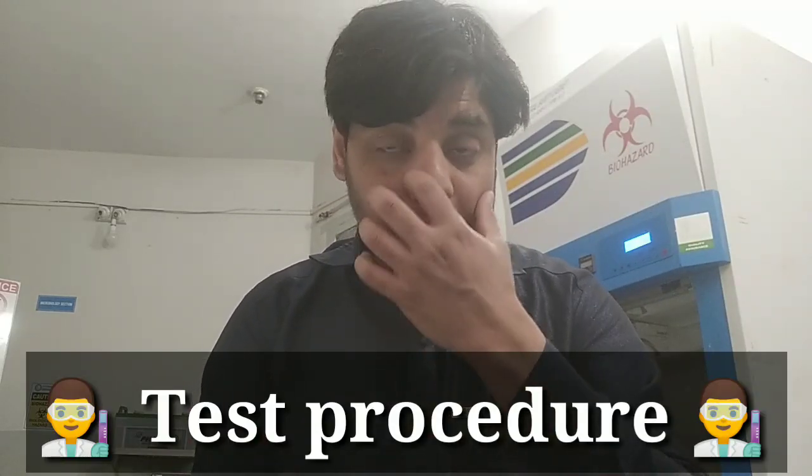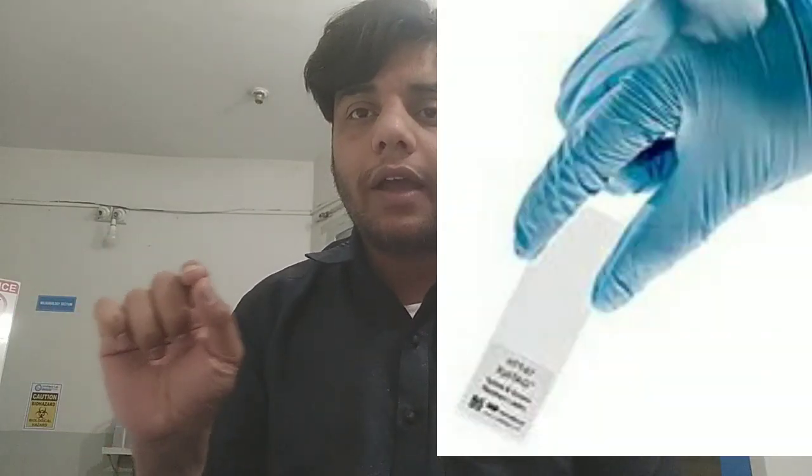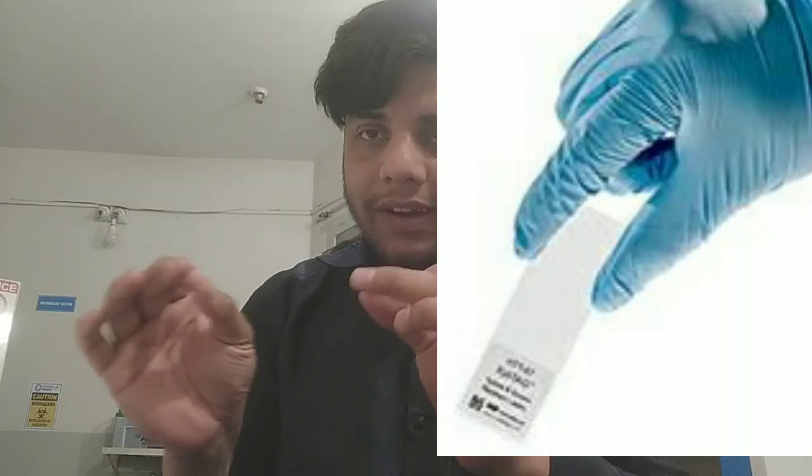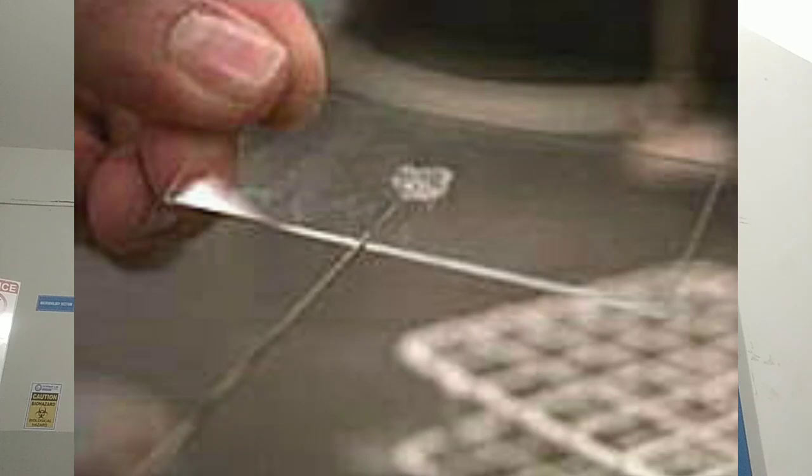The procedure is very simple. First of all, you have to take a clean glass slide and label it. Let's suppose you have the specimen on a swab, or you have a bacterial colony on an agar plate. What will you do? You will put 1 drop of distilled water on the slide, take the bacterial colony and mix it into the water drop, and make the smear. You will heat fix it, so the smear will be easily made.